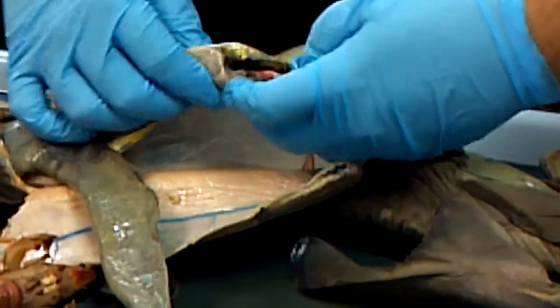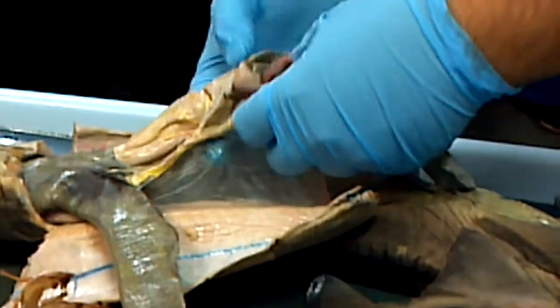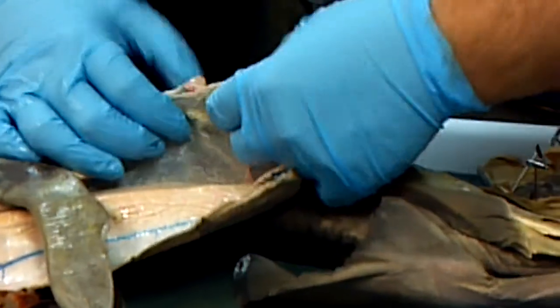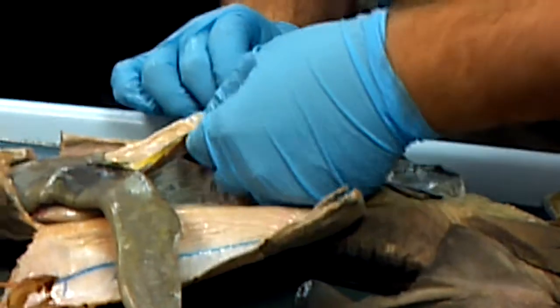Stomach. And we have the spleen at the end of the stomach and the pancreas next to it. Spleen, and then pancreas.